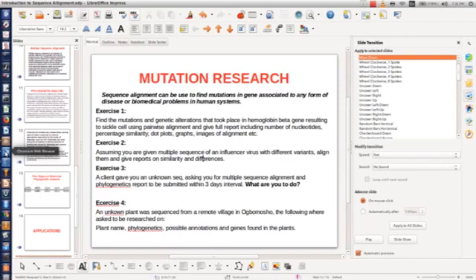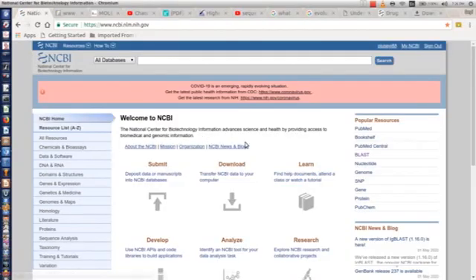Now, the first thing you need to do is download the different hemoglobin beta gene data from the database. But what you need to do is BLAST, because you already have your query, the one you are working on, the original one. There are times, for instance with this coronavirus, we can look into the variations of coronavirus in Nigeria, compare with every other coronavirus sequence from different states, from different countries, even compare with the one from Wuhan, which is in China.